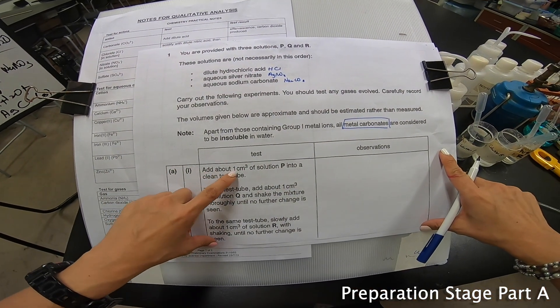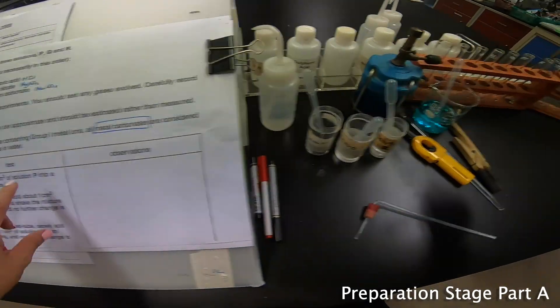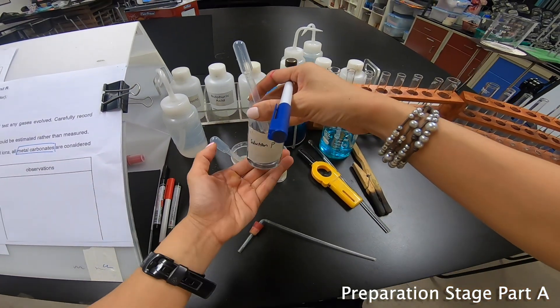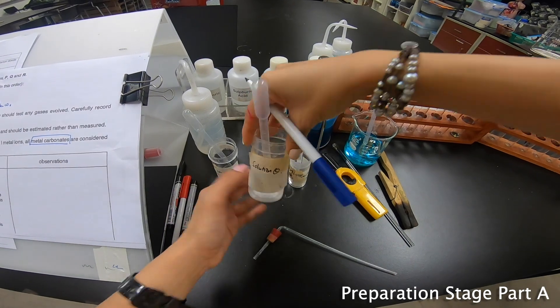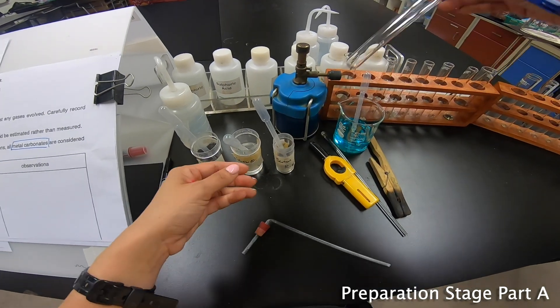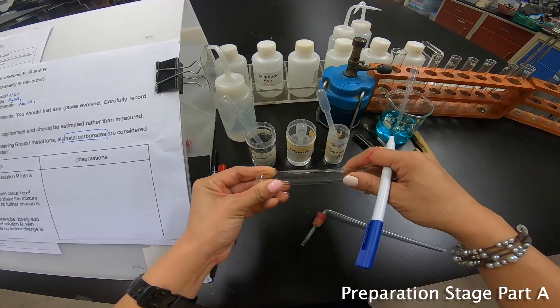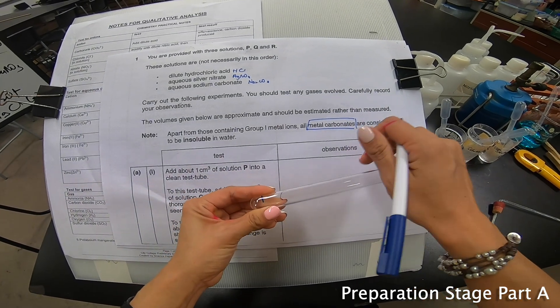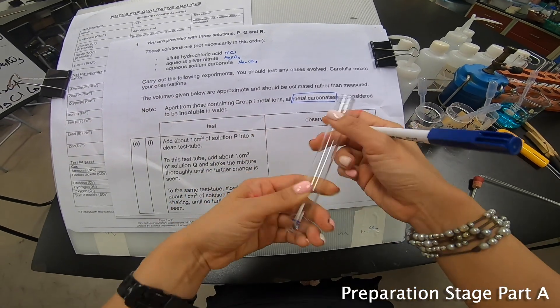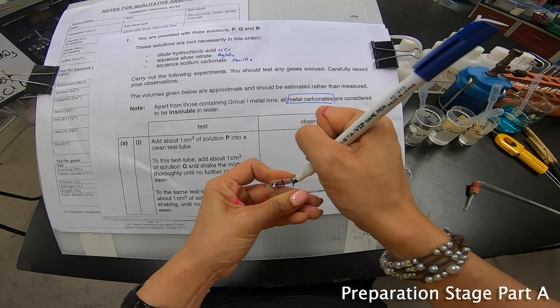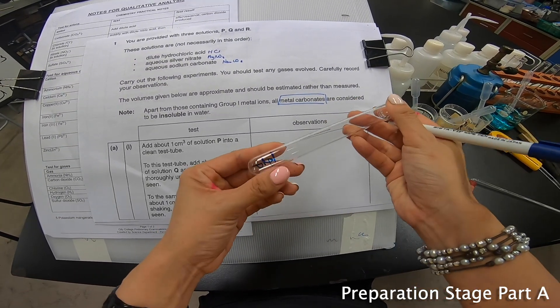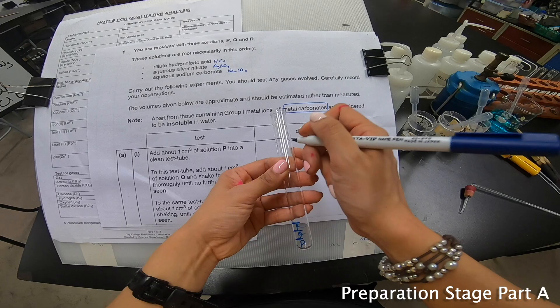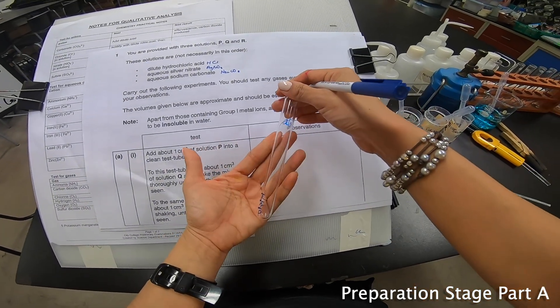Here says add about 1 cm³ of solution P into a clean test tube. These are all the test tubes given. I have with me P, Q, and R. So right now, let's do the preparation. I need to prepare a 1 cm³ of P. This is 2 cm³, 1 cm³ of P. I just need to make sure that I label it P. And another 1 cm³ of Q. And then another 1 cm³ of R.